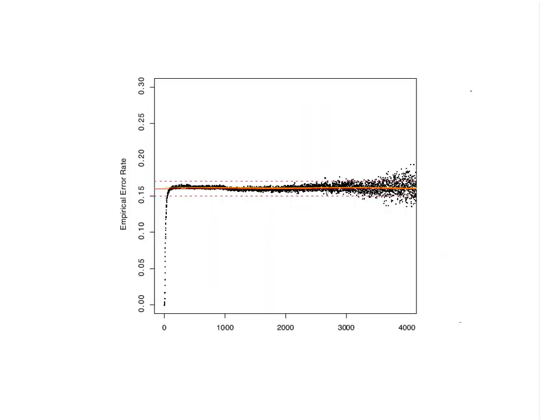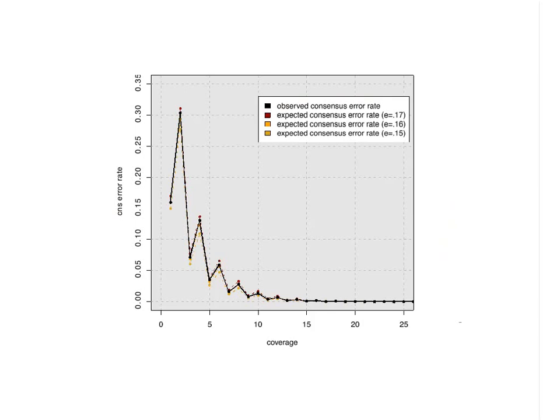So even though the individual reads have a high error rate, as the coverage of even the high error PacBio reads increases to above like 3 or 4x coverage, you can start to knock out the errors in the PacBio reads using only the PacBio reads themselves. So we've added some recent code to the pipeline that, in areas where there's coverage gaps in Illumina, we can use the PacBio reads themselves to form a consensus sequence, and that's been working quite well.